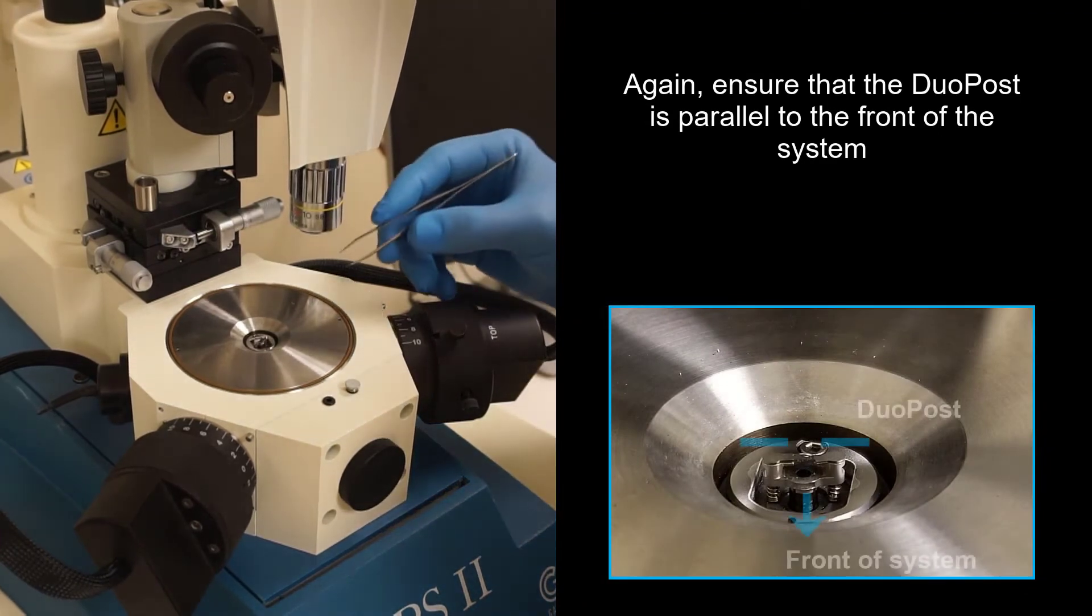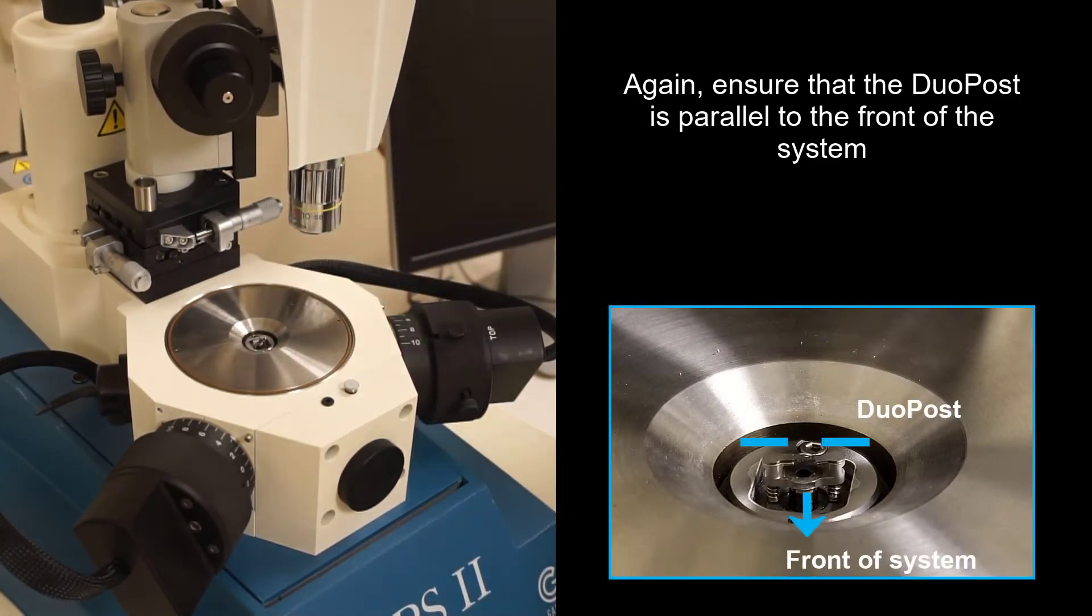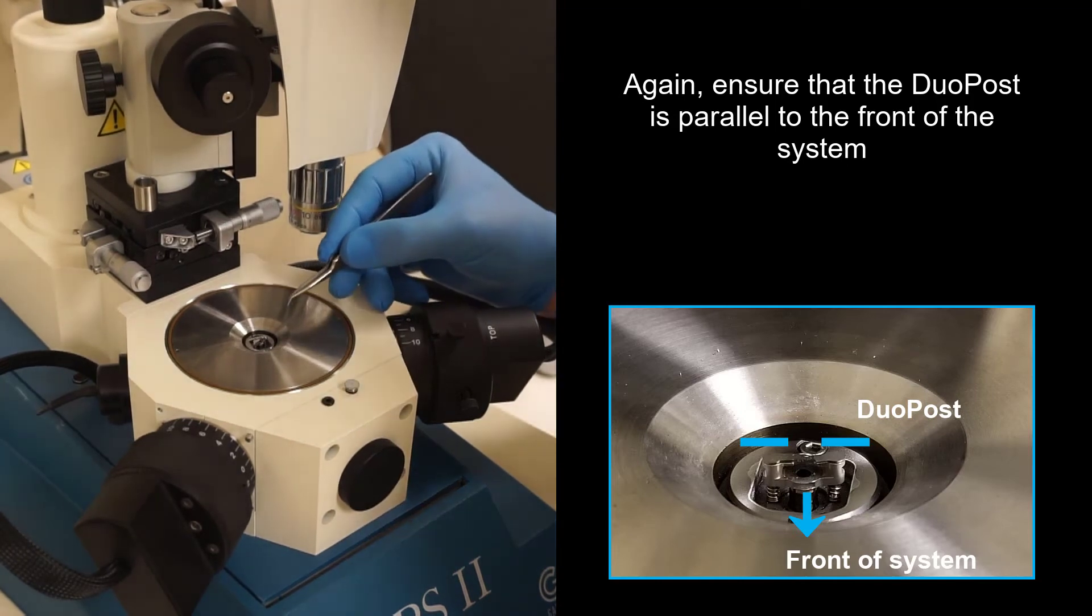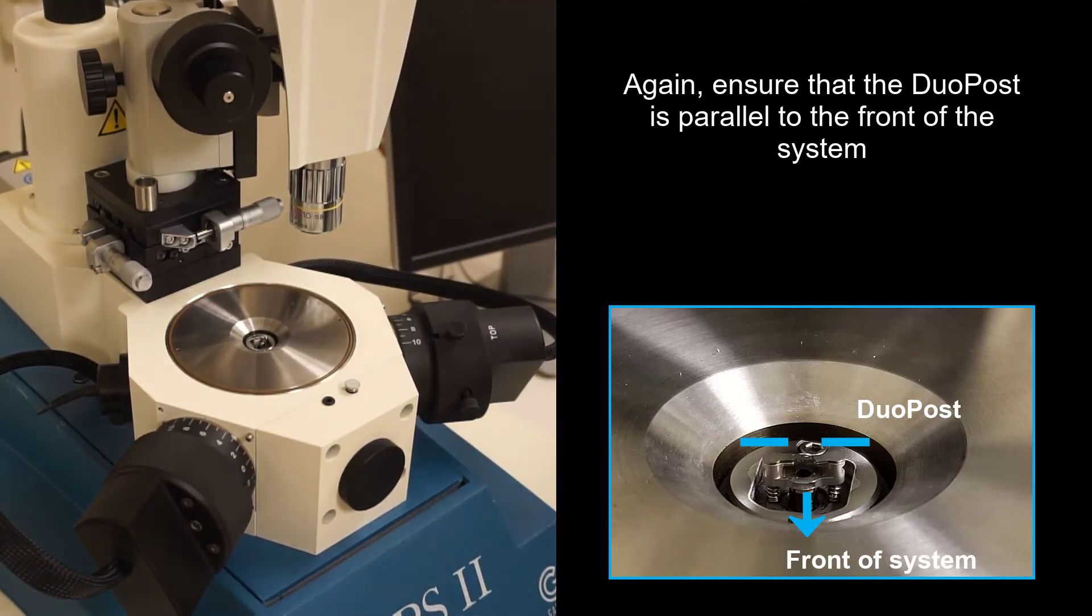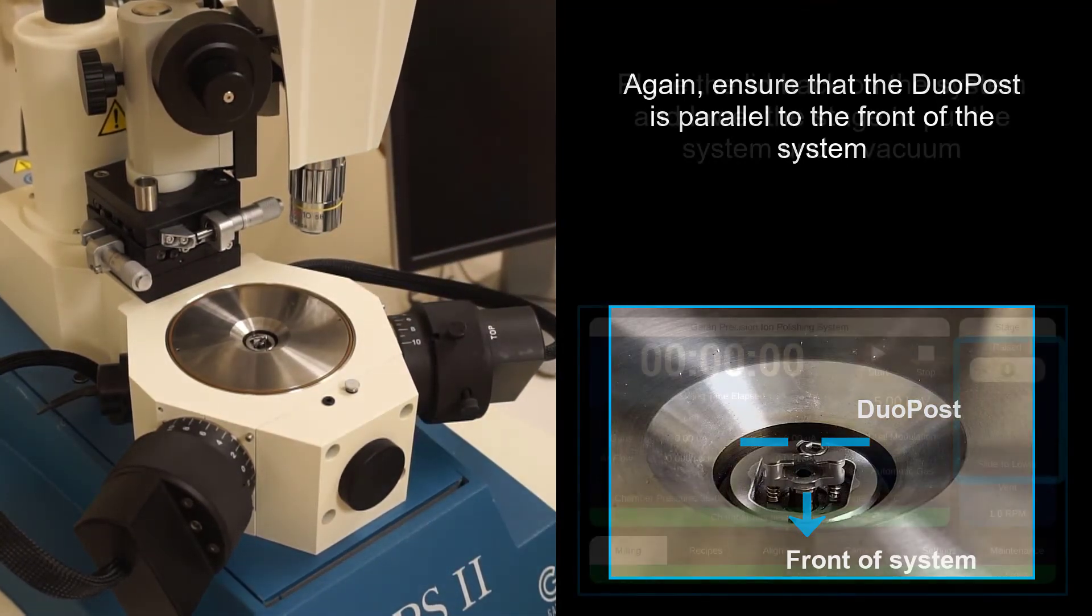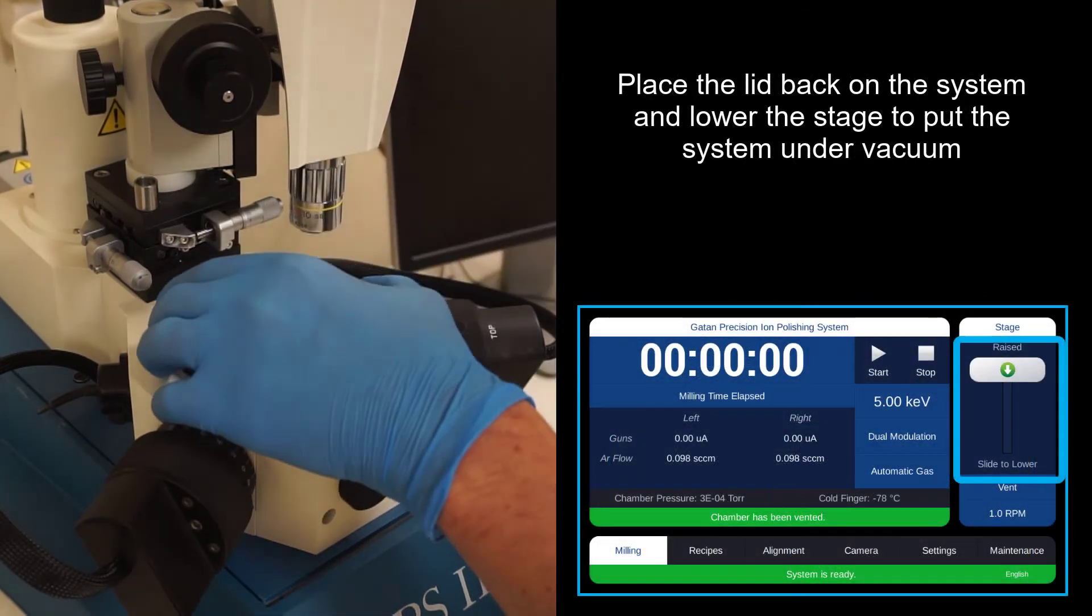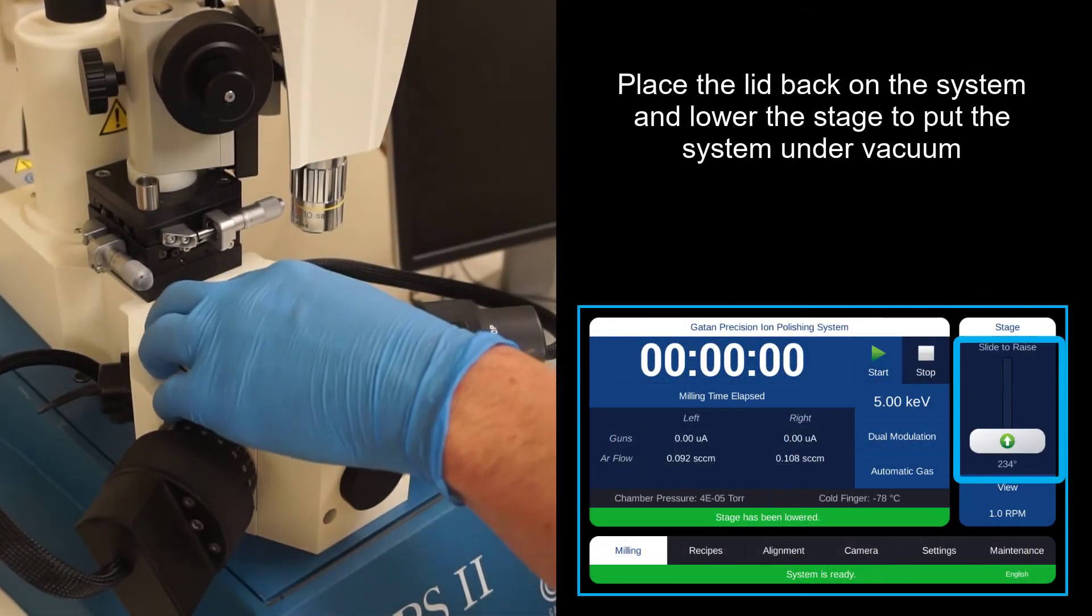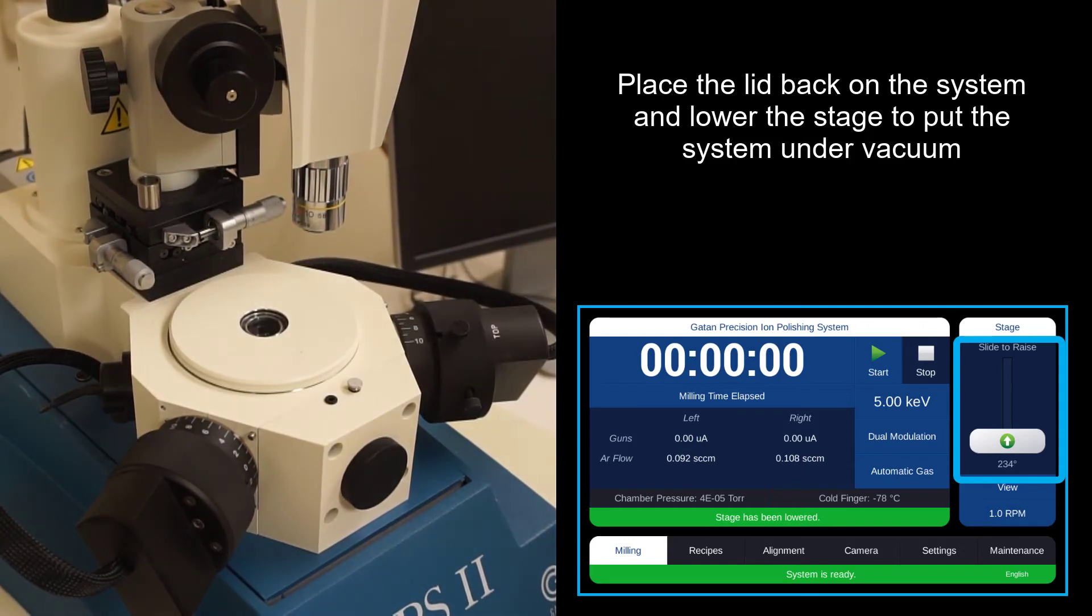Have the sample two arms here parallel with your shoulders and the DuoPost little fingers facing forward. Put the lid back on and now you can lower the stage which will put the chamber under vacuum.